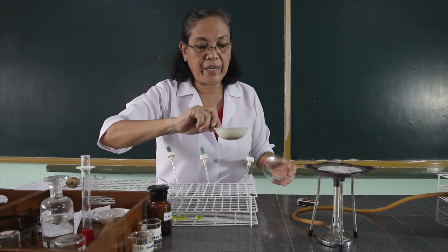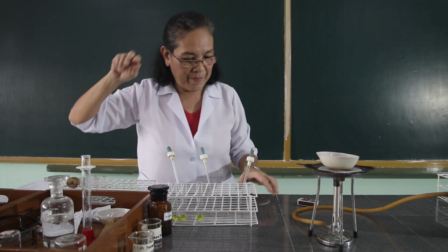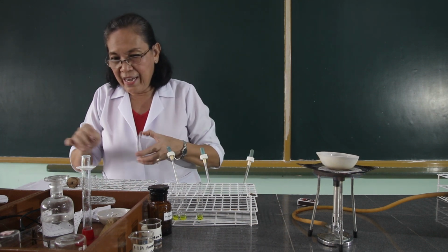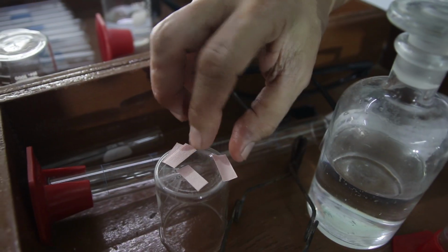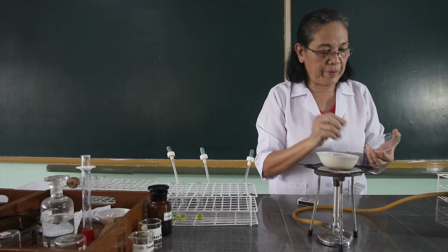We're going to heat this over the flame. And let's put a red litmus paper.